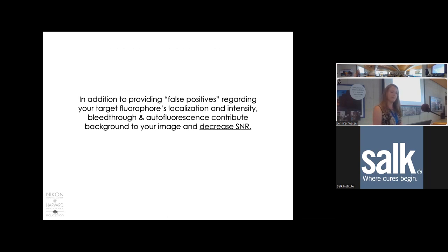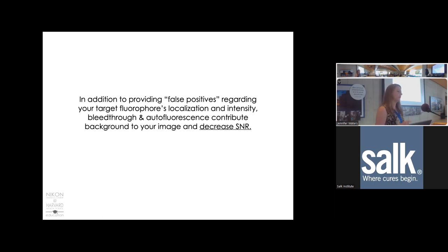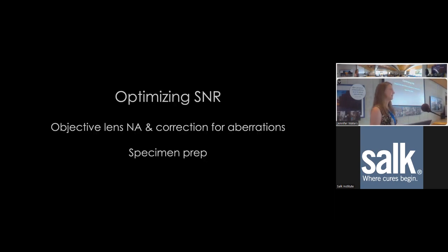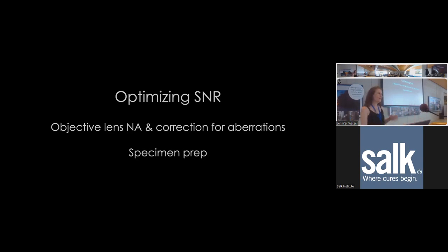Bleed-through and autofluorescence contribute background to your image and decrease signal-to-noise ratio. It's important to minimize these off-target photons to get the best signal-to-noise ratio possible. The second part of the lecture will continue with tips and tricks to optimize signal-to-noise ratio, focusing on objective lenses and specimen problems.